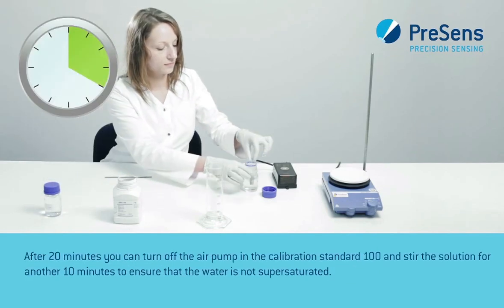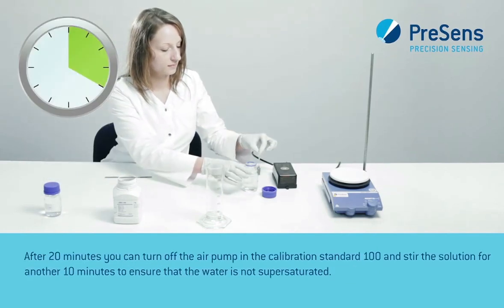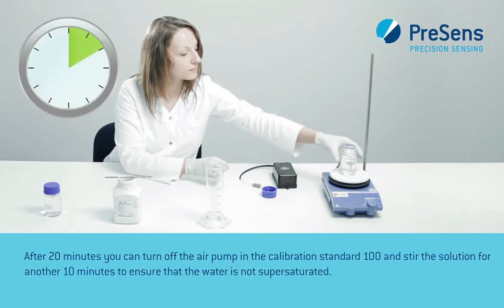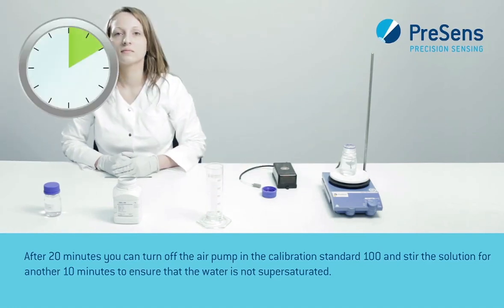After 20 minutes, you can turn off the air pump in the calibration standard 100 and stir the solution for another 10 minutes to ensure that the water is not supersaturated.